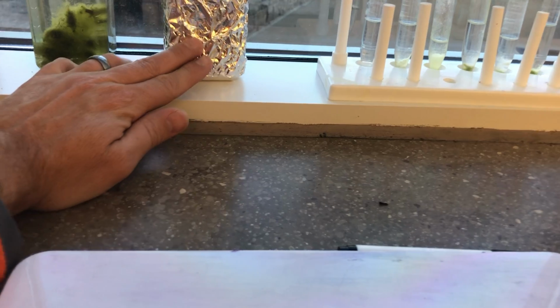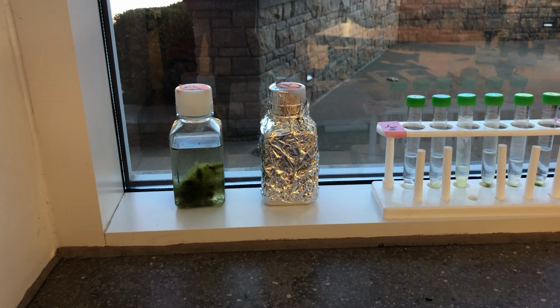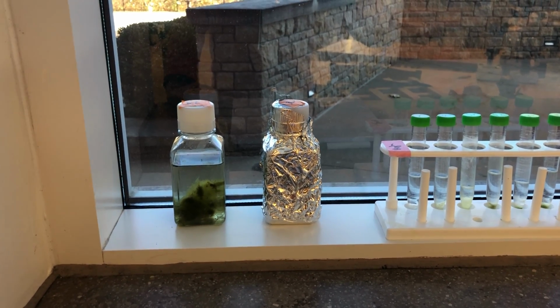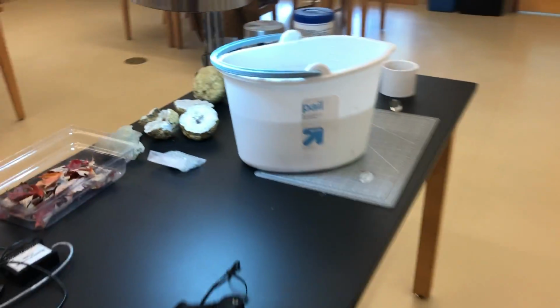But this has been out in the sun, receiving sunlight in treatment type 1, and in treatment type 2, the one that's opaque, it can't receive any sunlight. These have been here for precisely 4 days. I measured the dissolved oxygen before, and now I'm going to bring them back into the lab and measure the dissolved oxygen for a second time. And then I'll share the data.